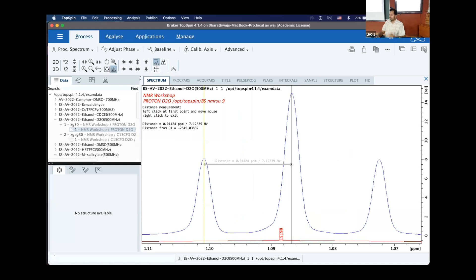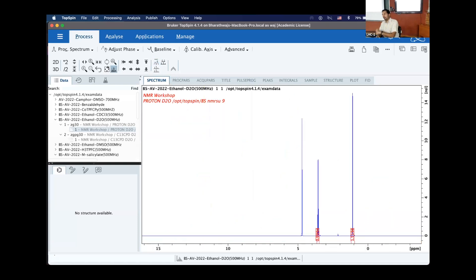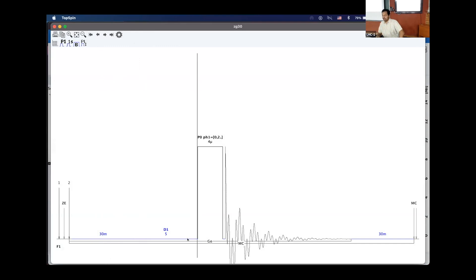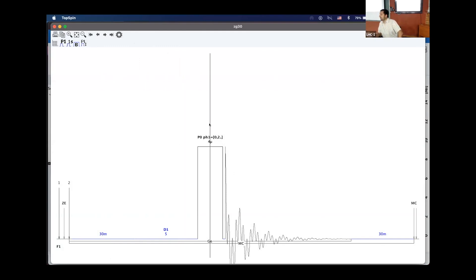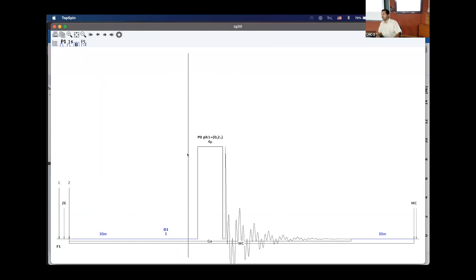Looking at the pulse program: D1 is set to ~5 seconds (which is why integrals work well), the acquisition time is 3.27 s, giving a total recycle delay of ~8.27 s. The pulse applied is 4 µs long; since 8 µs is a 90-degree pulse on this spectrometer, 4 µs corresponds to a ~45-degree flip angle. This demonstrates how experimental parameters are set in practice.